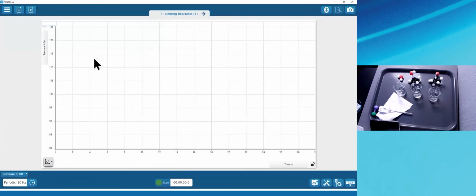Okay, this lab is one of our most popular labs. When we do this at like NSTA, we run out of seats. It's very popular. Sorry, I've got my camera on this same setup here. I'm going to swap out my setup.